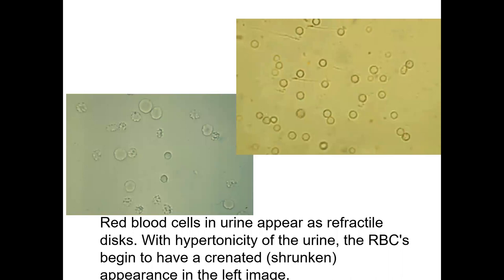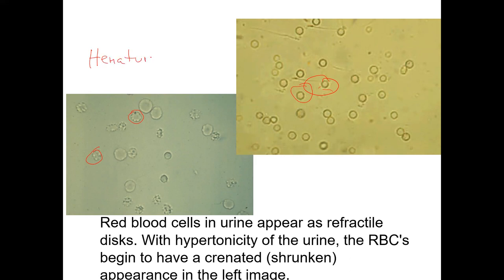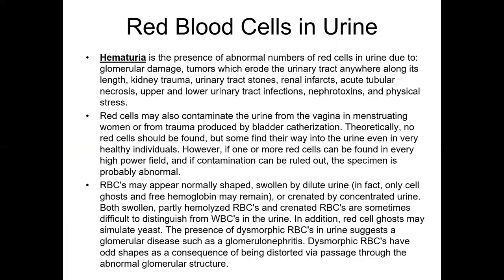Here's what you need to know for the quiz or exam. These are red blood cells seen under a microscope. You can see they're crenating and shrinking. Notice you really can't make out a nucleus — red blood cells are anuclear. When you have red blood cells or blood in the urine, it's called hematuria, and you don't want to see that. Causes include urinary tract infections, nephrotoxins, certain medications, trauma, and calculi — which are kidney stones.